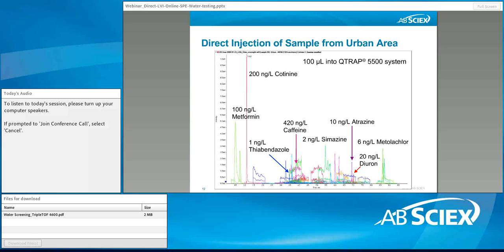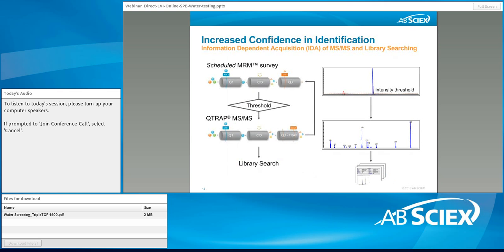Here's a sample collected in a creek going to a small city in Ontario. And on top of that, you can now see the influence of humans. So we can detect caffeine, cotinine, again a couple of pesticides which are legally used here in Canada, people using them in their backyards, and thiabendazole, probably coming from people washing their fruits in the sink, and going through the wastewater system into the creek.